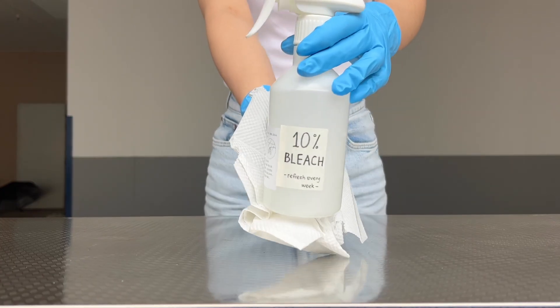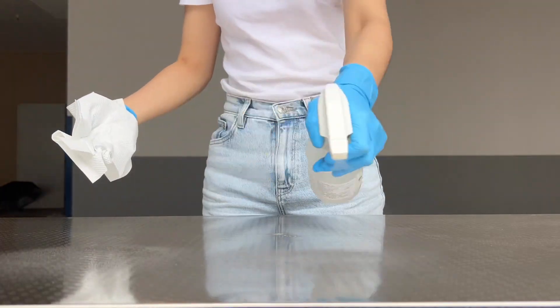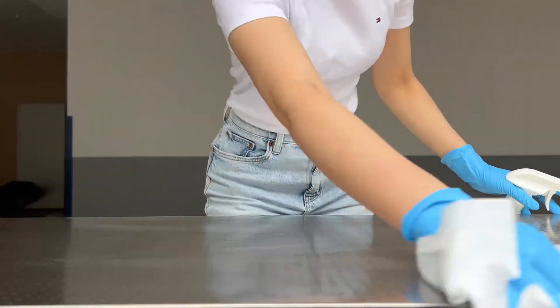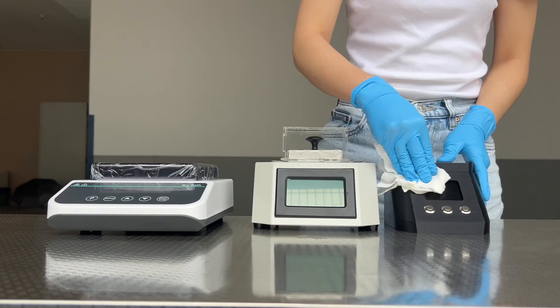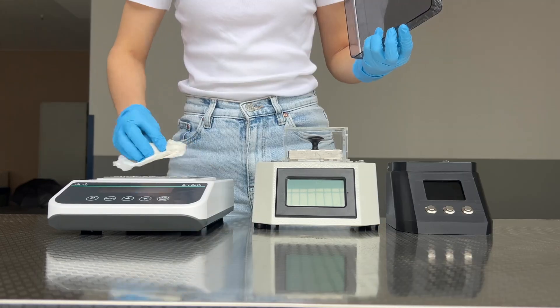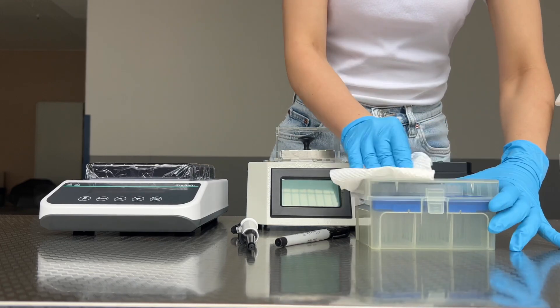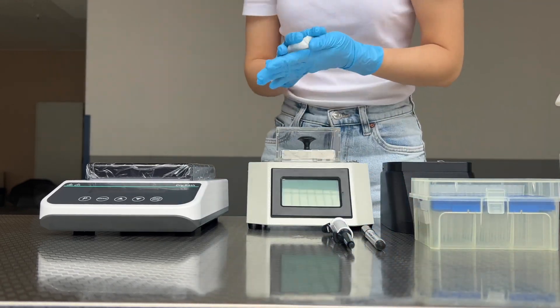Let's begin by setting up and disinfecting the workstation. Using a spray bottle, spray 10% bleach onto the workstation and wipe it with a paper towel. Spray the 10% bleach on a new piece of paper and wipe down the machines, pipette, marker, and pipette box. Ensure that the equipment is wiped dry and no bleach residue remains. We can proceed to testing samples.